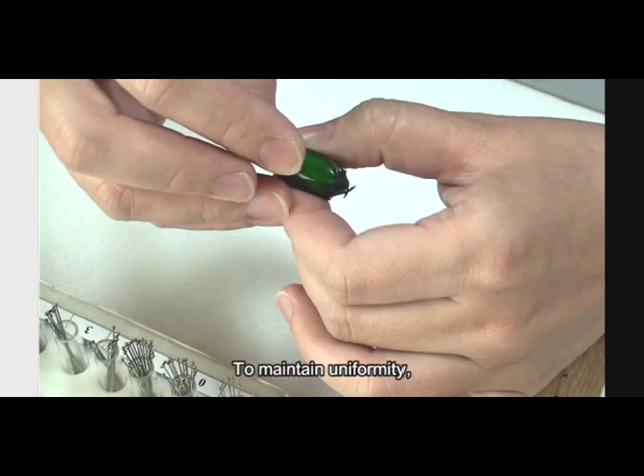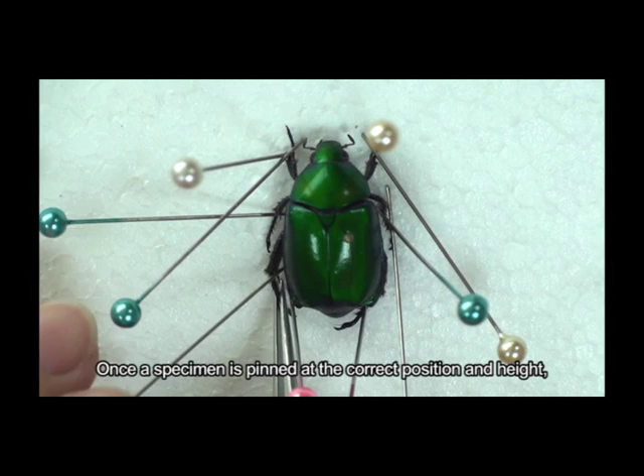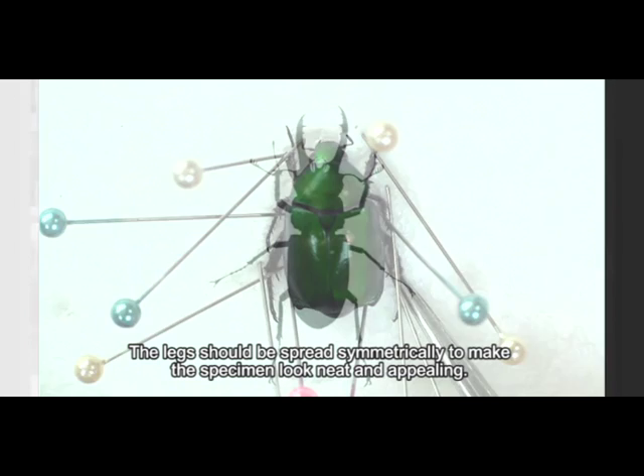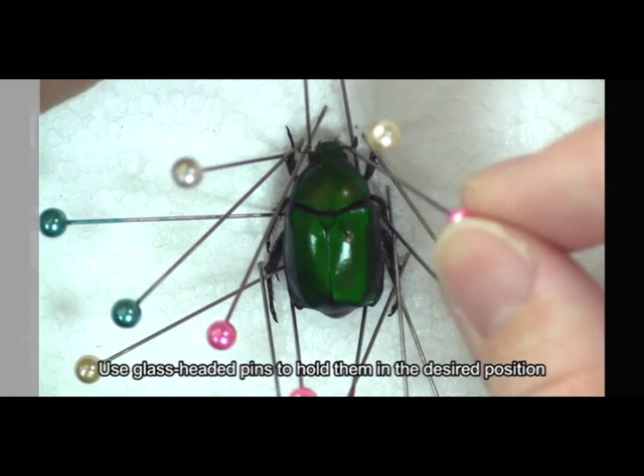All pinned specimens must be mounted at a uniform height on the pin. To maintain uniformity, the pin is inserted into the hole of the top step of the pinning block after the specimen is placed on the pin. Once a specimen is pinned at the correct position and height, it is desirable to extend the legs so that all parts can be easily visible for study. The legs should be spread symmetrically to make the specimen look neat and appealing. Antennae and abdomens deserve extra attention; use glass-headed pins to hold them in the desired position and prevent them from sagging or twisting until the specimen is dry.